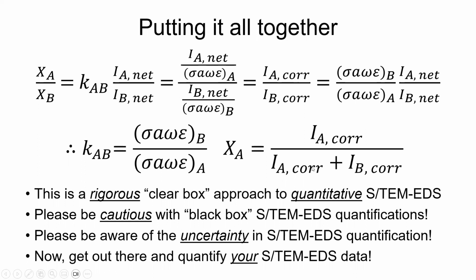But this is a rigorous, what I call clear box, approach to doing quantitative STEM-EDS, okay? This isn't like when you punch in numbers into software and you're just getting a result out, okay? You know what's going into it, right? What's going on, how the math works, what the values are, okay? This is much different than the black box calculations where you're just saying, okay, here's a spectrum, give me an answer, right? That's a black box calculation. And I would always be very cautious when you use those, okay? Because you don't know what's going into it and you don't know what is included in that, okay?